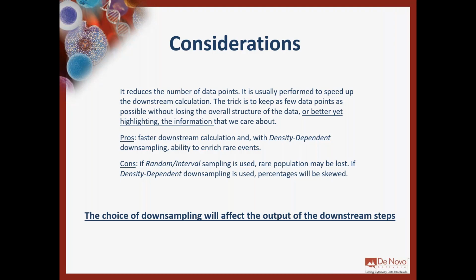You have the option to go further than the classical random and interval sampling, which might be very useful if you're doing something really hard, like 10, 20, 30 million events, and you want to downsample. And it's not really rare to go that high with the number of events, because when you're running high-dimensional data analysis, after the pre-processing, you're going to merge data.